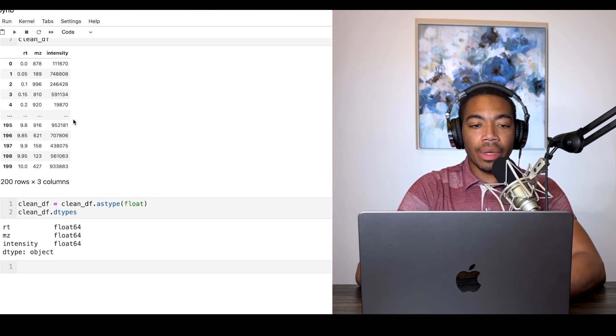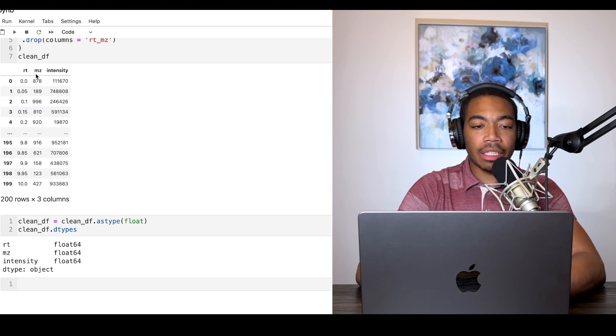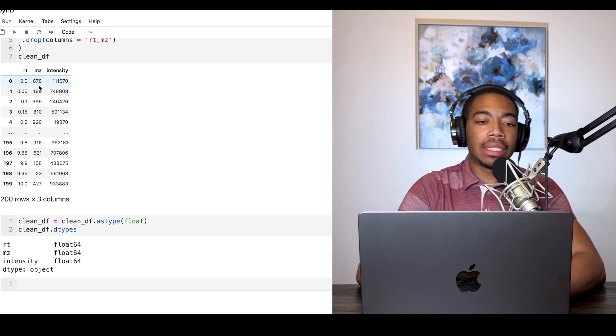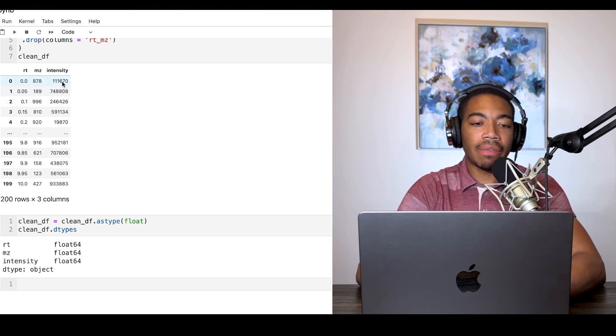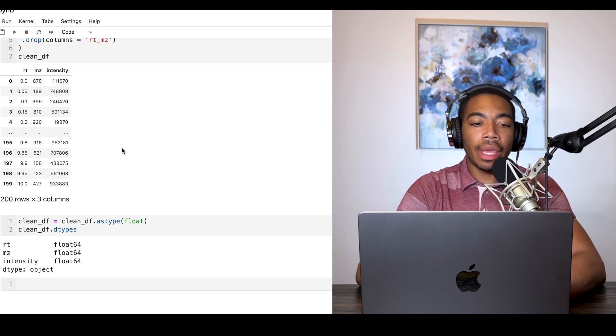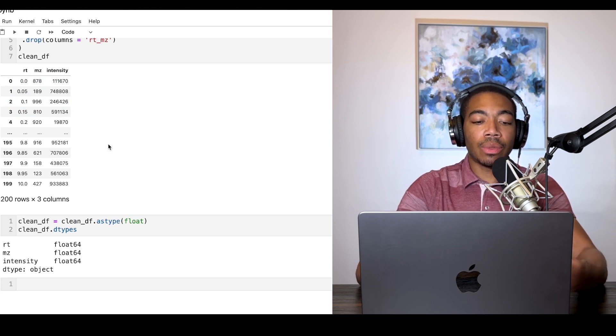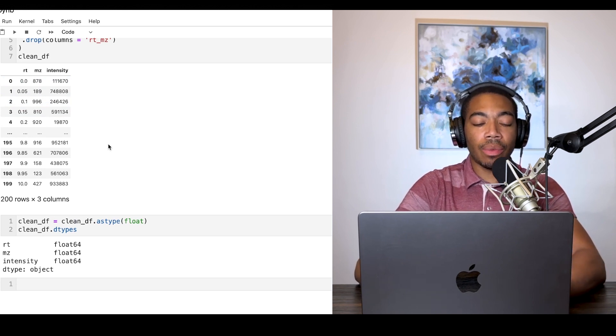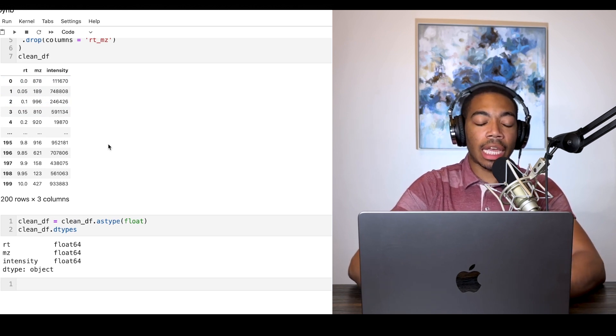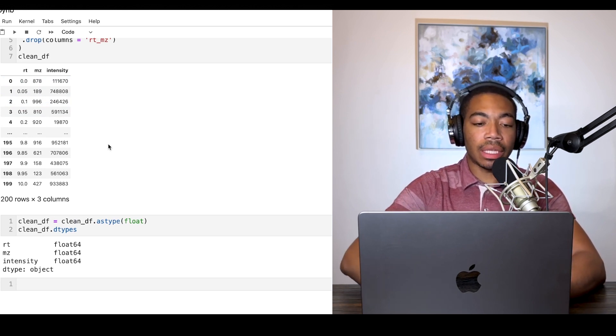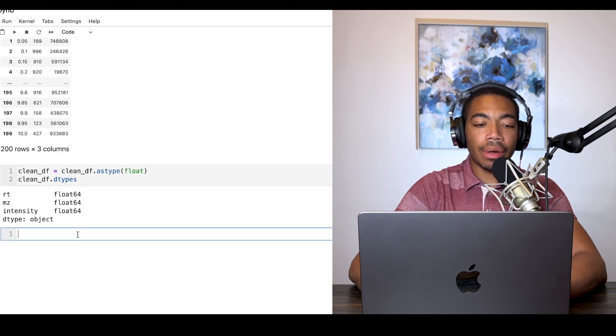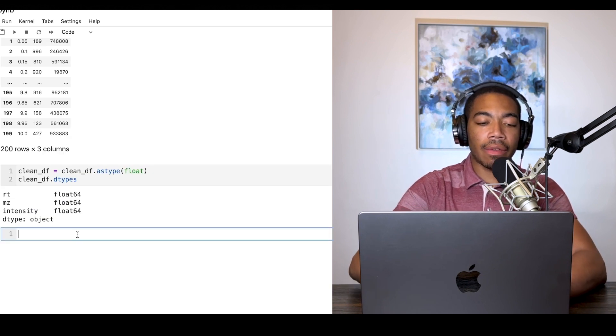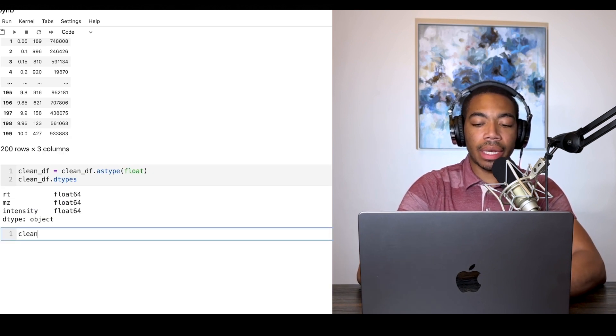We could go back and specify and make m/z integers and keep the intensity values integers, but this is just one way to ensure that we have the right data type for this dataframe. Here now we have a cleaned up dataset.